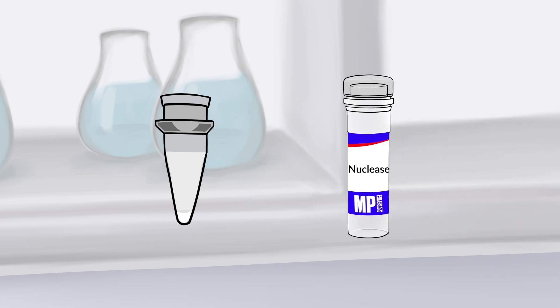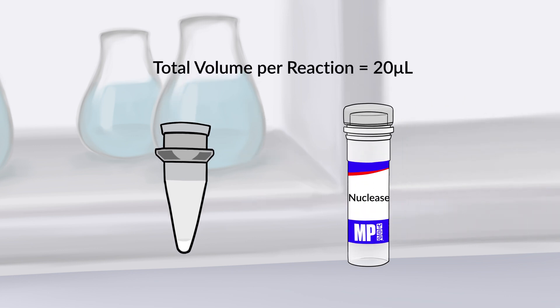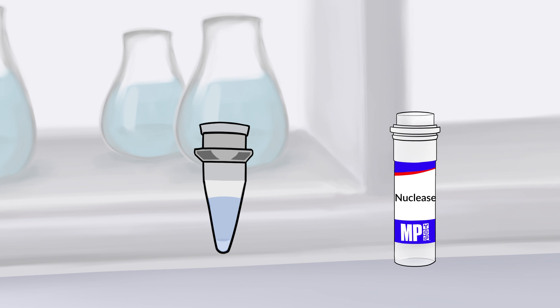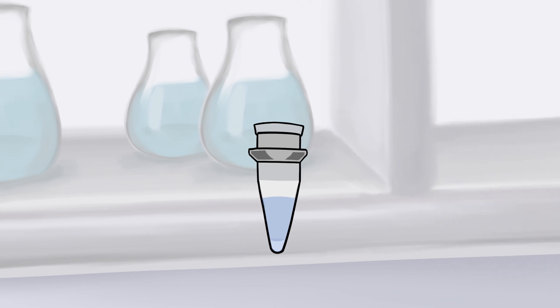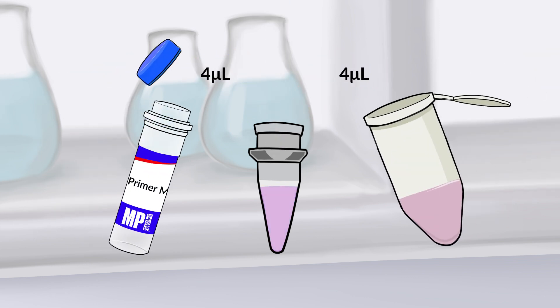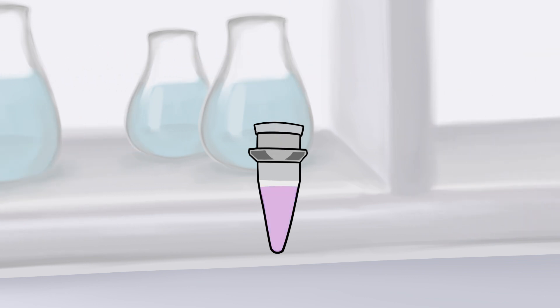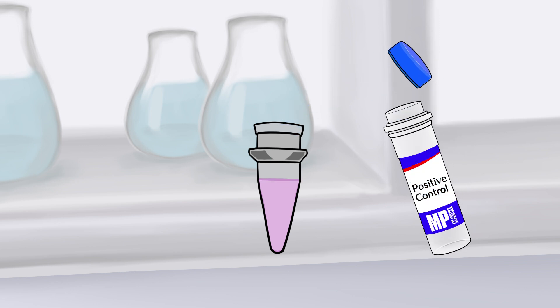Determine the volume of nuclease-free water needed to add to each reaction bead's tube. The total volume per reaction should be 20 microliters. Add the calculated volume of nuclease-free water to each tube. Pipet up and down to dissolve the reaction beads. Now add 4 microliters of primer mix and up to 4 microliters of sample to each tube. Add 1 microliter of controls to the appropriate tubes.